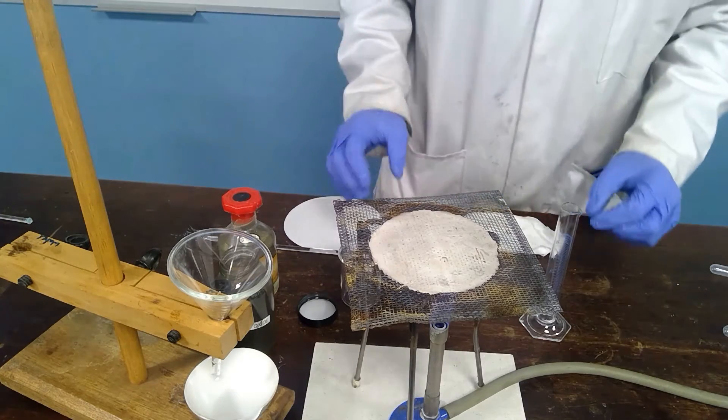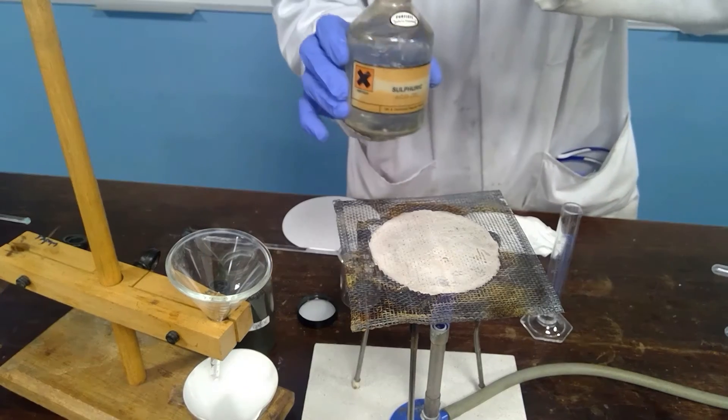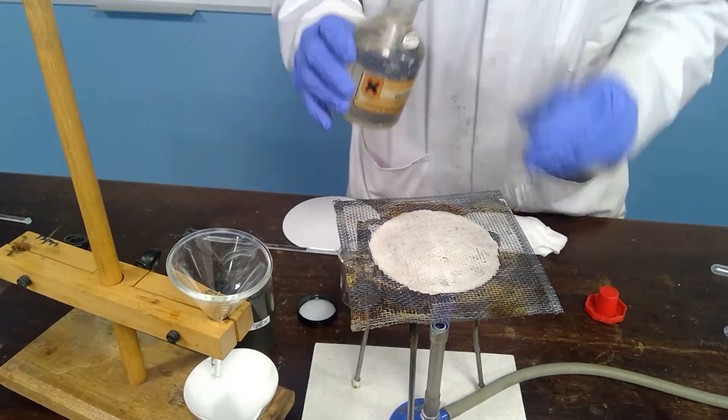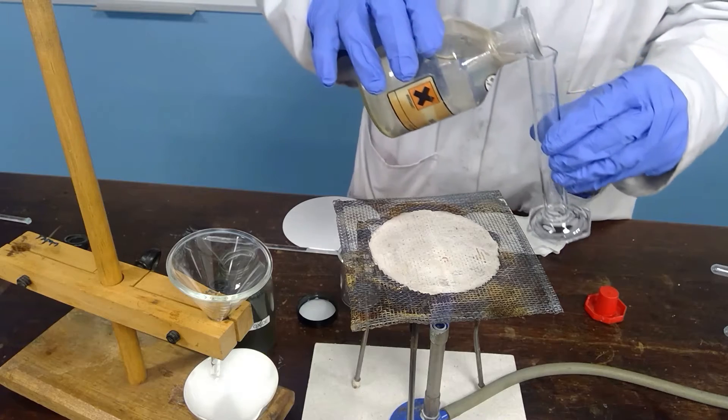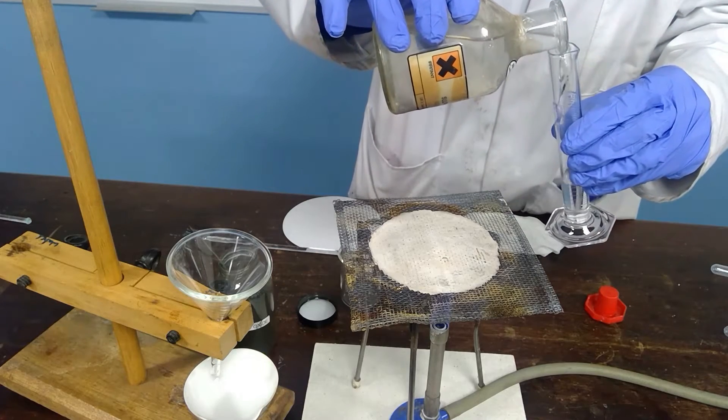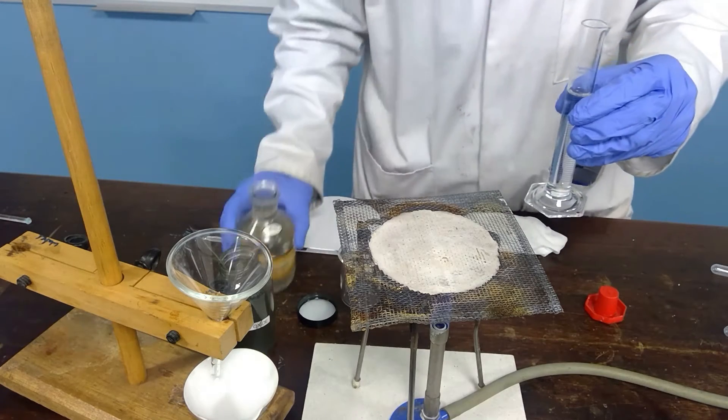To speed things up we are going to use sulfuric acid which is heated. We're using approximately 25 cm cubed of the sulfuric acid. This is dilute sulfuric acid.